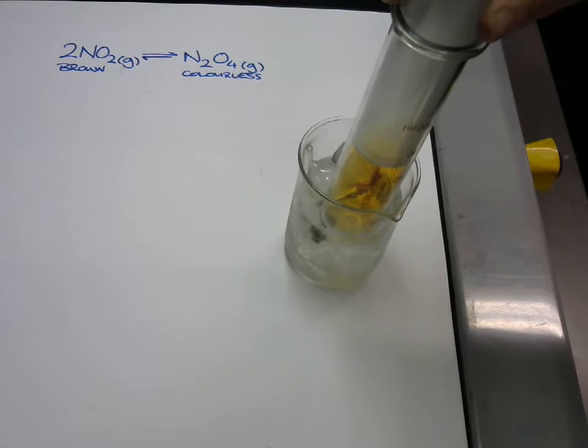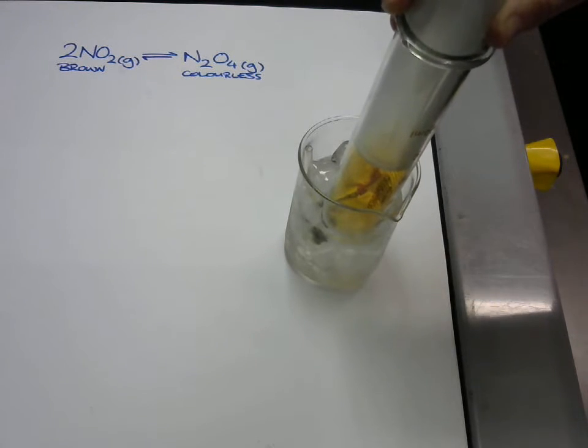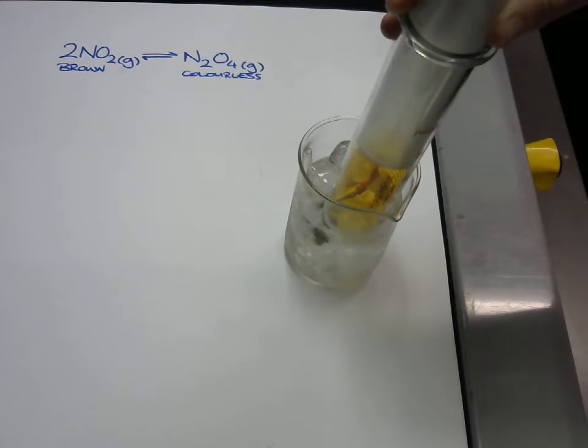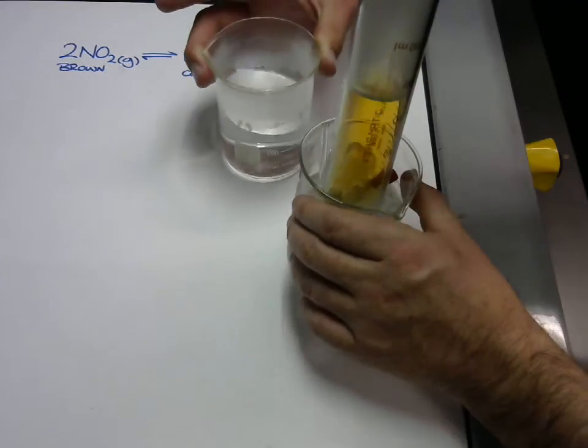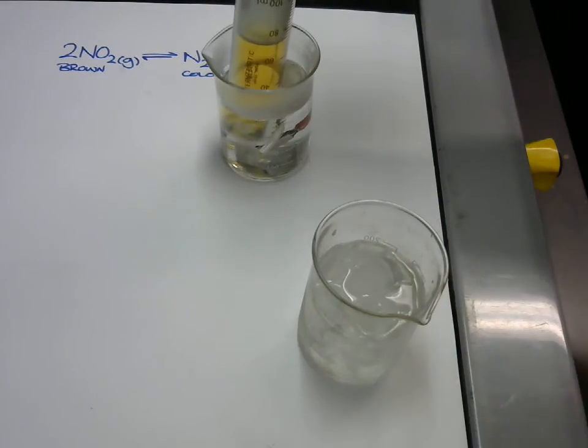Okay, let's make it really obvious. Is there boiled water there? Can you put that in that other beaker, please? I'm trying not to let the syringe move, because that's another variable. Just enough to dunk this in. Awesome, if you just put that there for me, please. I'll move that out, and in without letting it push against me.